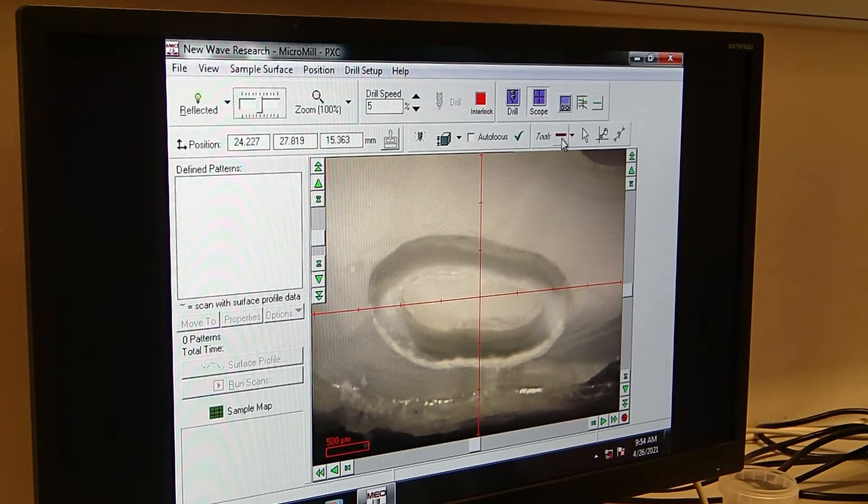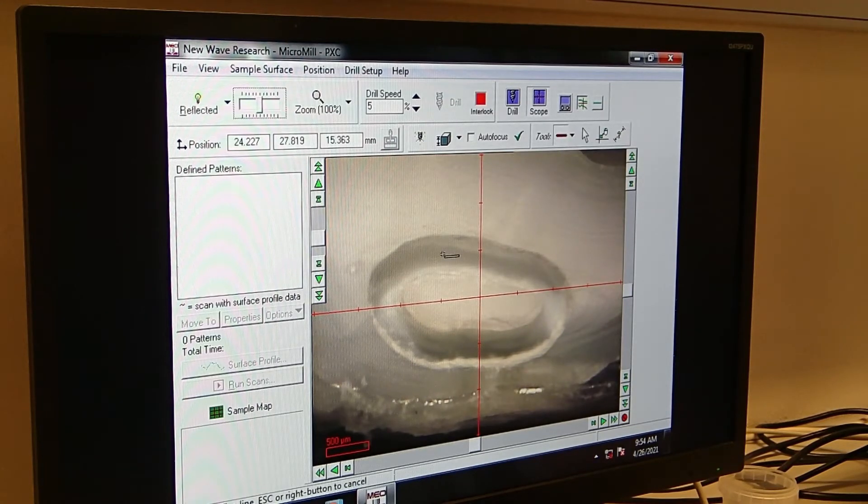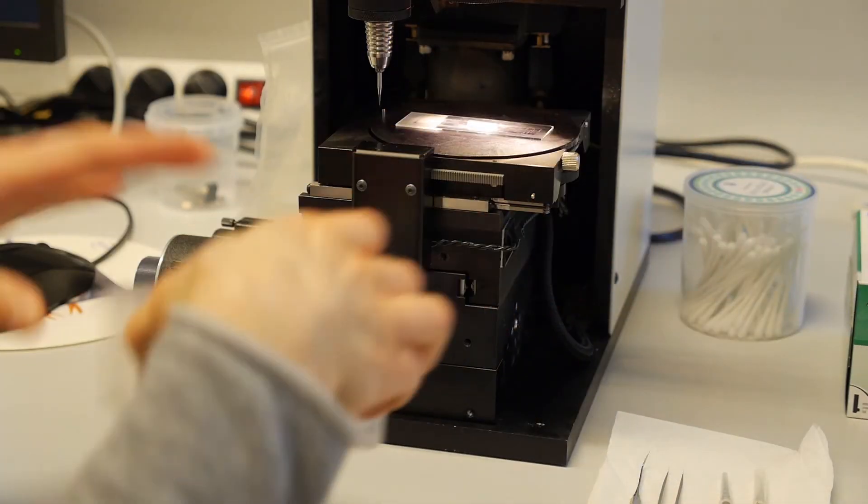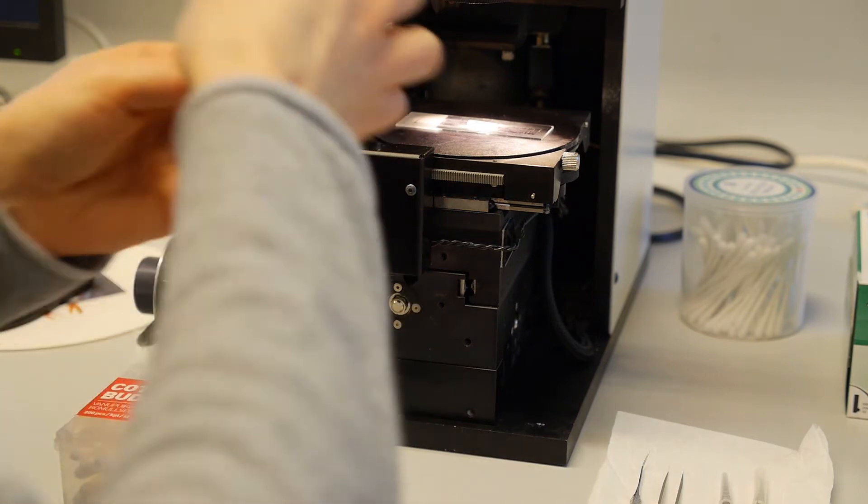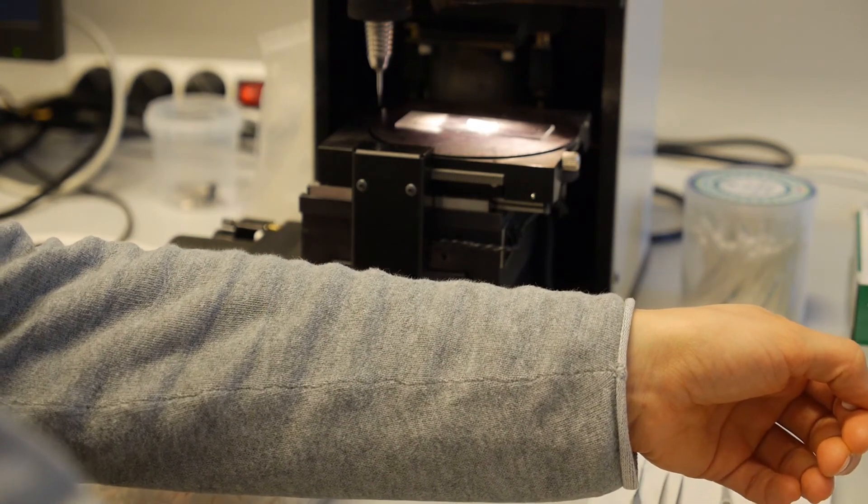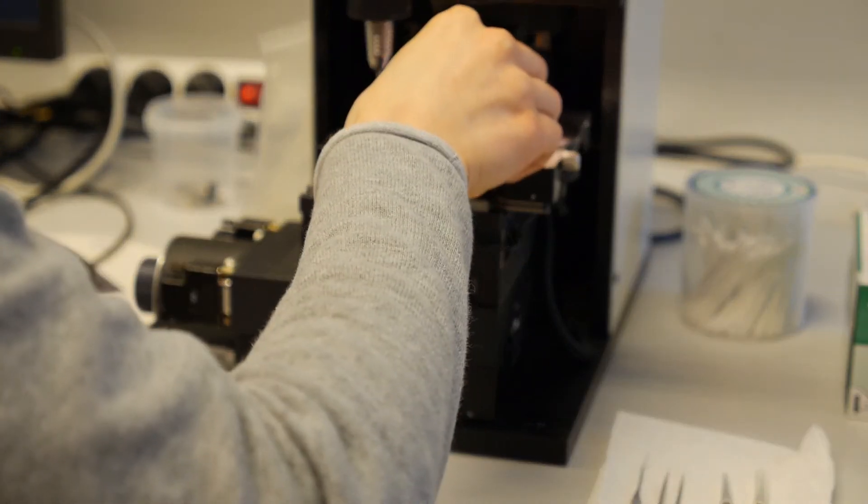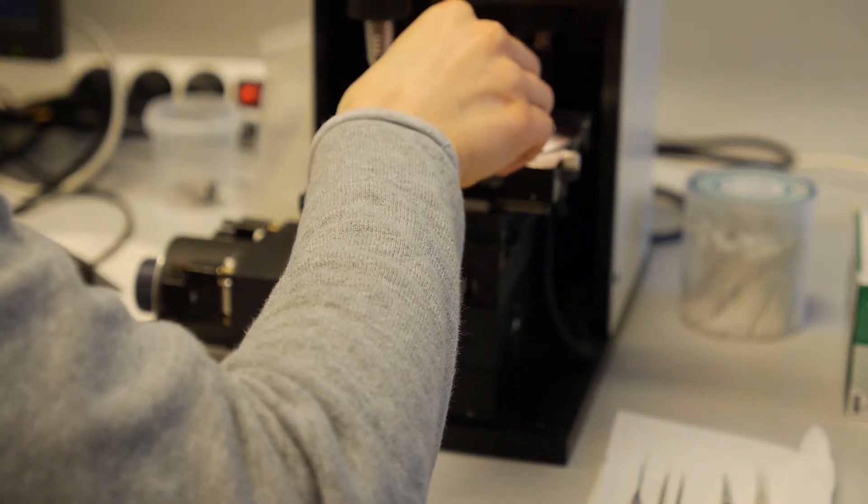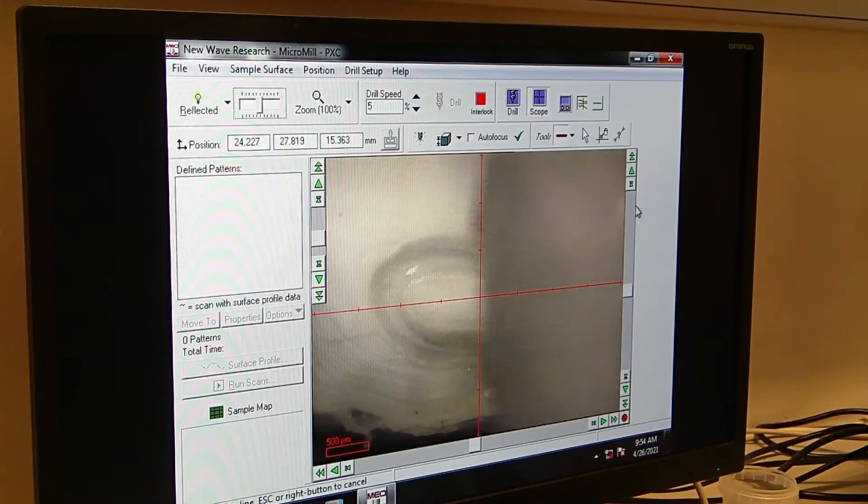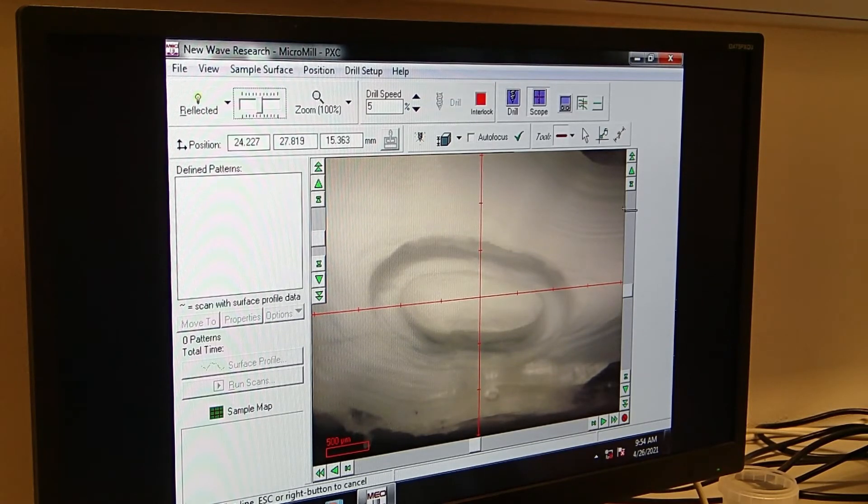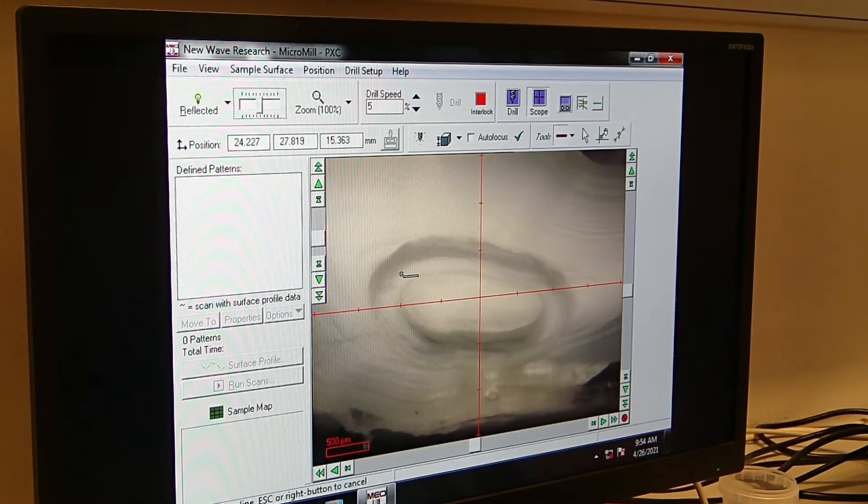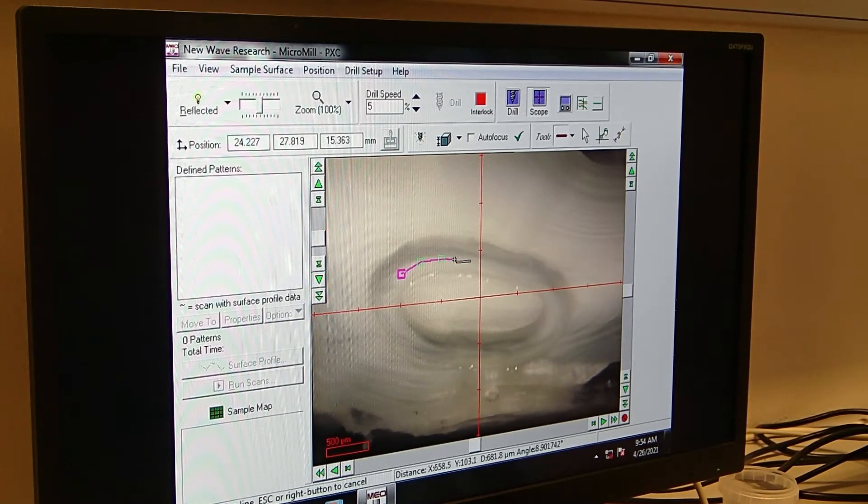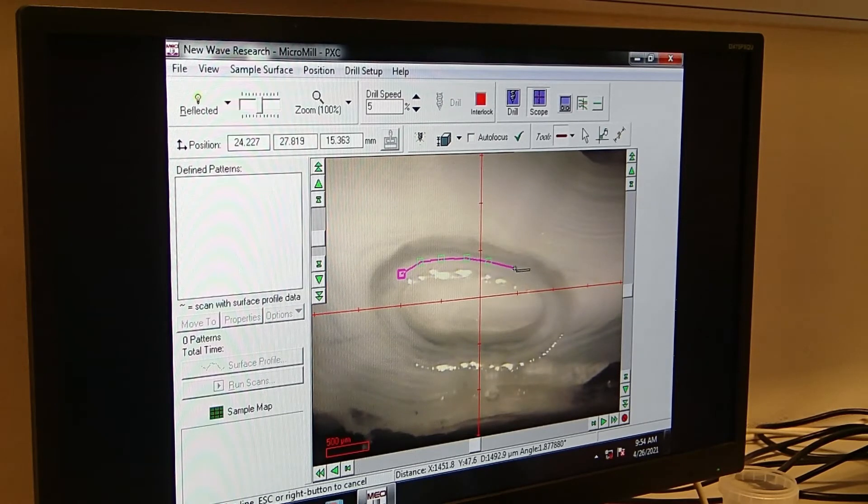And I click on tools and use the line tool. So I just click here on the line. So you would normally put alcohol on. Yes. So normally I would put some ethanol. I can just demonstrate it here. And here I use a cotton bud with some ethanol, put it on the autolid section to see it better. And it just enhances the visibility of the growth pattern and I'm sure that I take the right part of the autolid. Then I follow the growth pattern just by clicking it. So every point is one click to the left with the mouse.